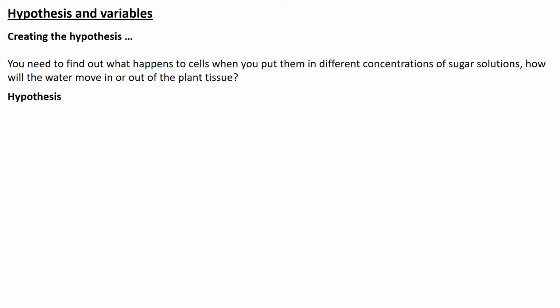So today we're going to be looking at what happens to cells when you put them in different concentrations of sugar, and how the water will move in and out. But a hypothesis is what you think will happen, based on your knowledge of what you know at the time.